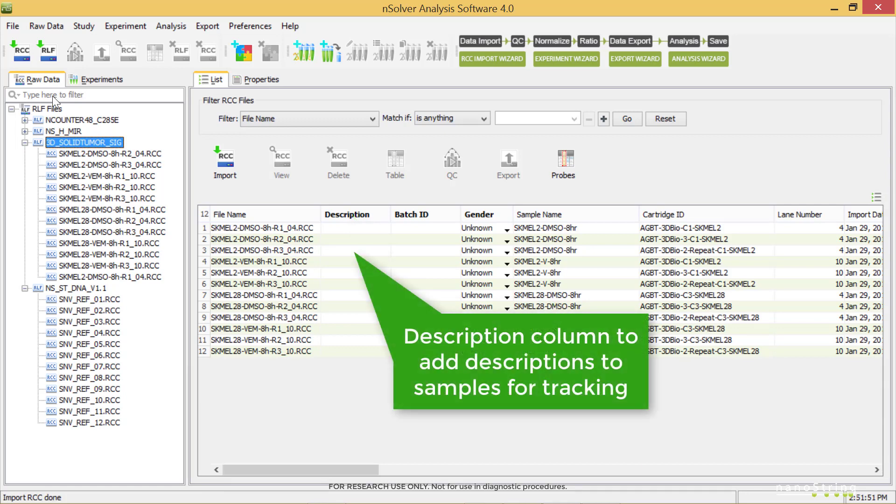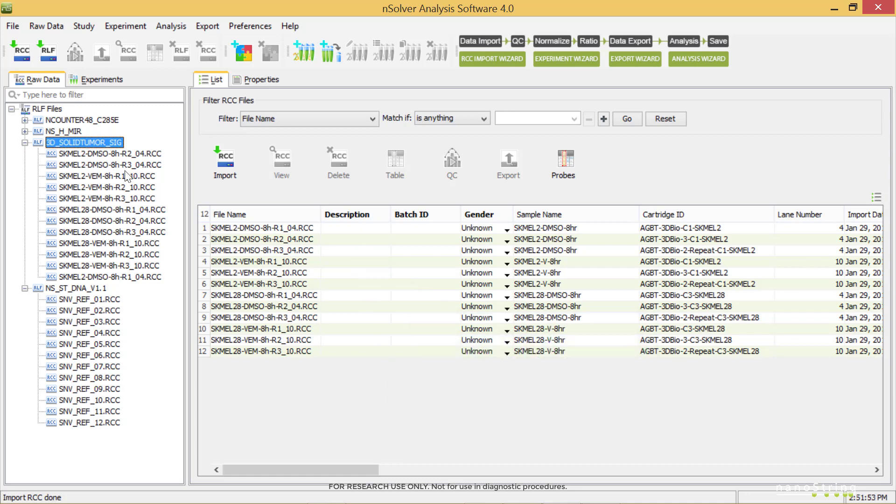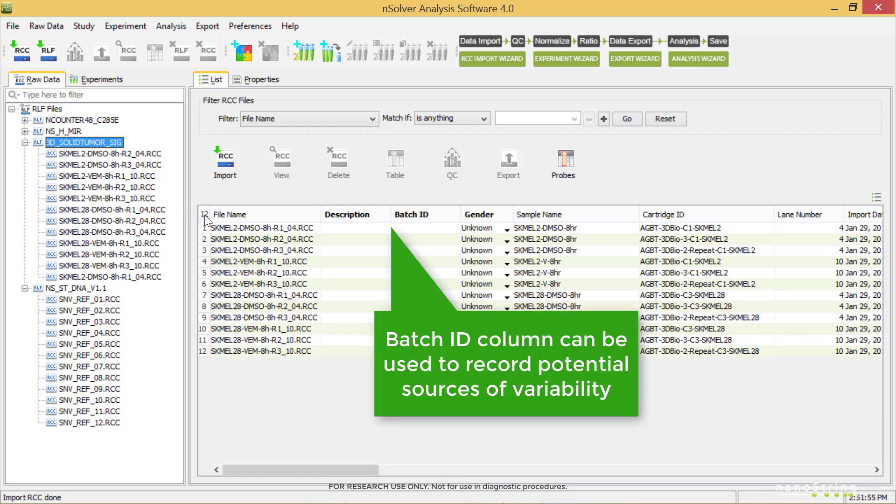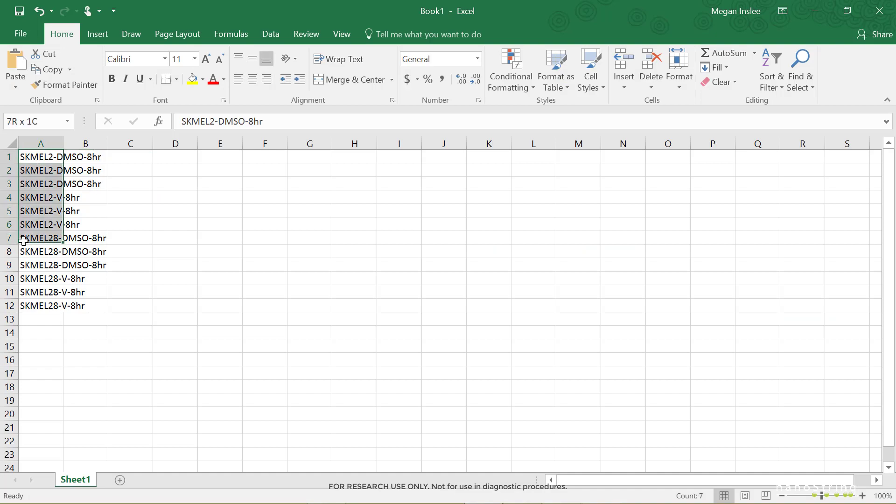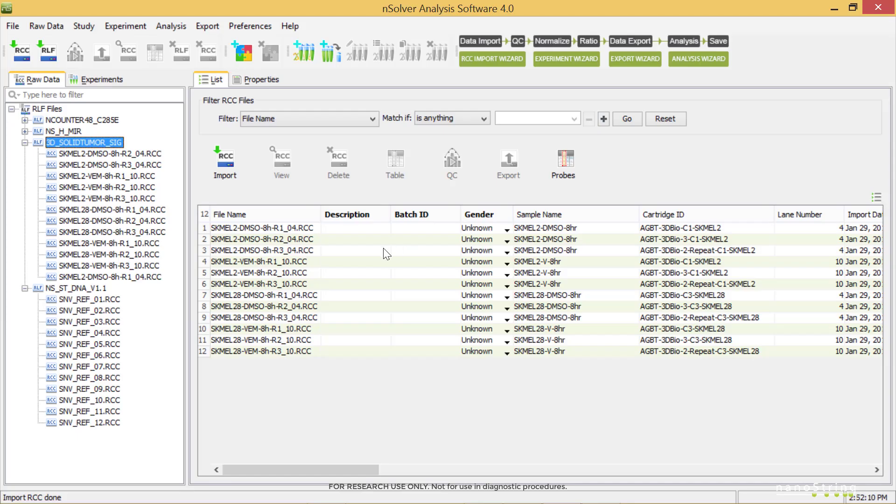The Description column is available to add description to samples that might be informative for tracking. This information is not used for analysis as annotations are when building an experiment. The Batch ID column allows you to record code set lot numbers or other identifying information of potential sources of variability in a run. You can type this information directly into the cells, or copy and paste from another source.